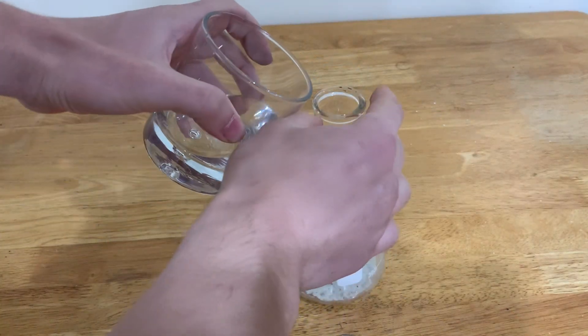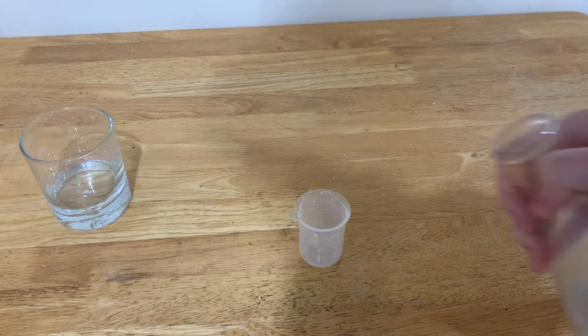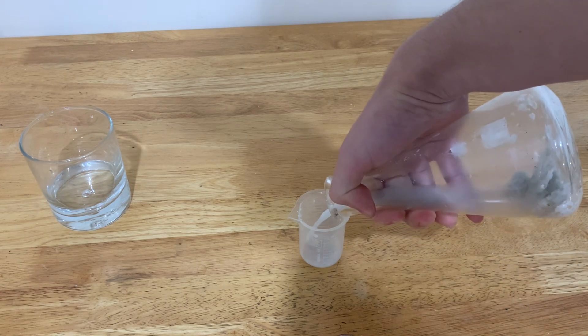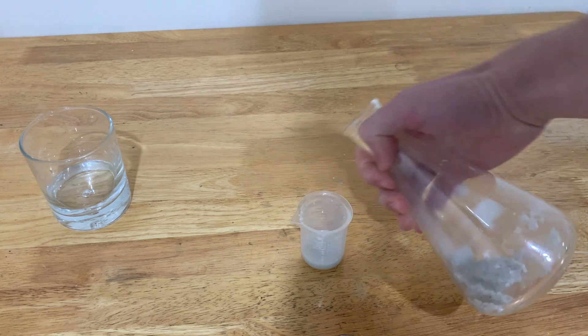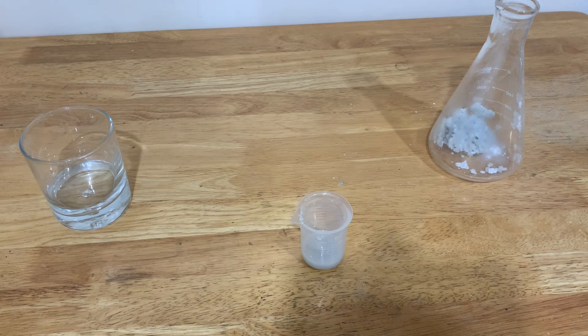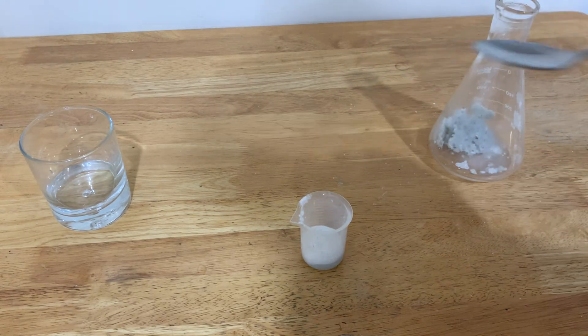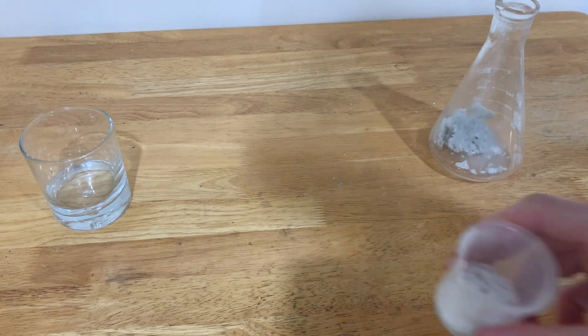I'll just pour some regular water into the flask, and now I'm going to pour the liquid out. As a result of sulfuric acid's infinite solubility, every single sulfuric acid molecule which was produced is inside of here. So to test it out, I'm going to get some baking soda and dump it in — and as you can see, it fizzes pretty well.